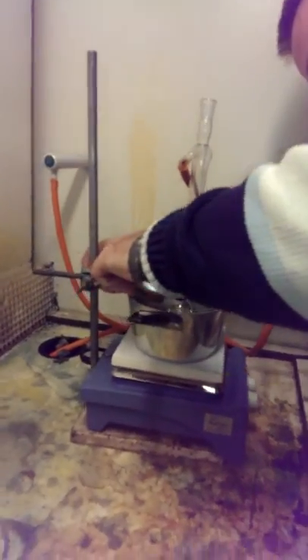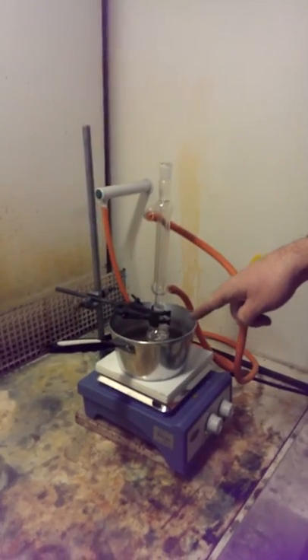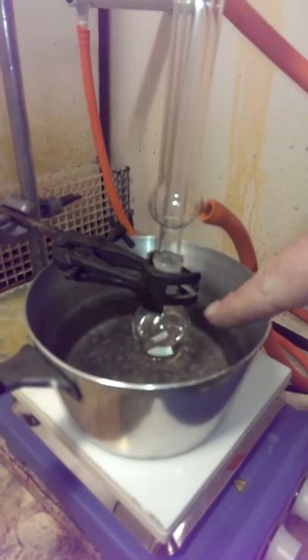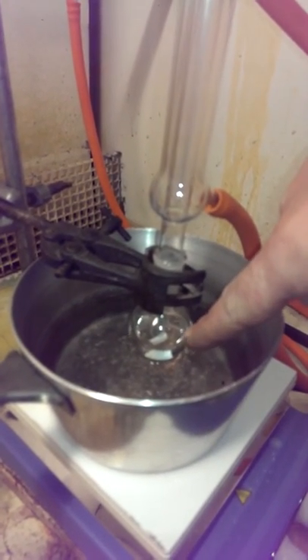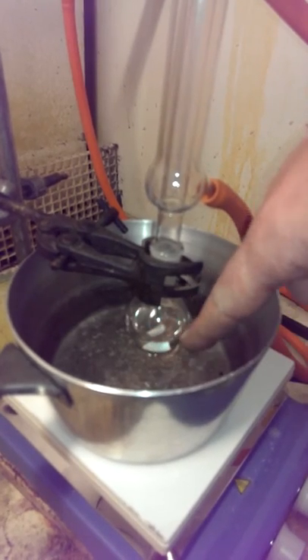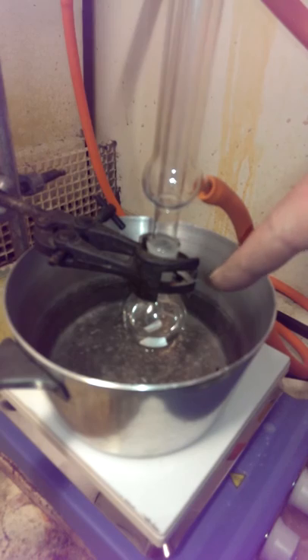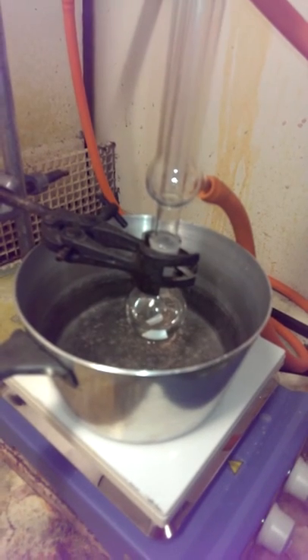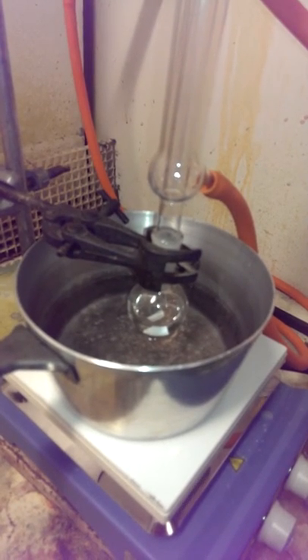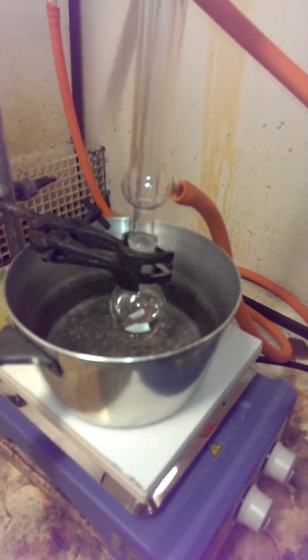So we've now got the flask in contact with the water. We make sure that the flask sits with the level of liquid inside the flask below the level of the water bath or the oil bath. What you don't want is to submerge the flask deep into an oil bath. That isn't refluxing at that point, that's getting it wrong. We don't want any of that.